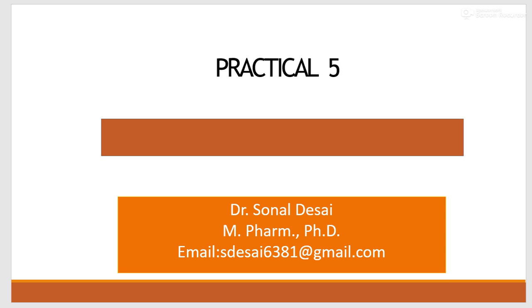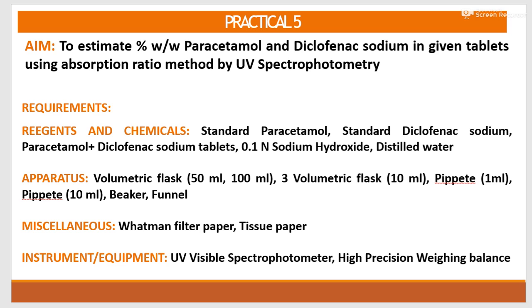Today we will discuss practical number 5, that is estimation of paracetamol and diclofenac sodium using absorption ratio method by UV spectrophotometry. So the aim is to estimate percentage weight by weight of paracetamol and diclofenac sodium in given tablets using absorption ratio method by UV spectrophotometry.